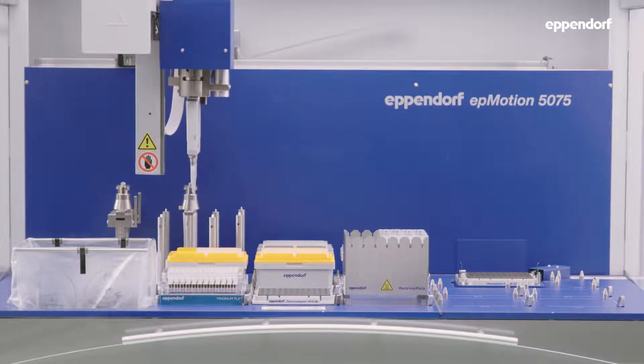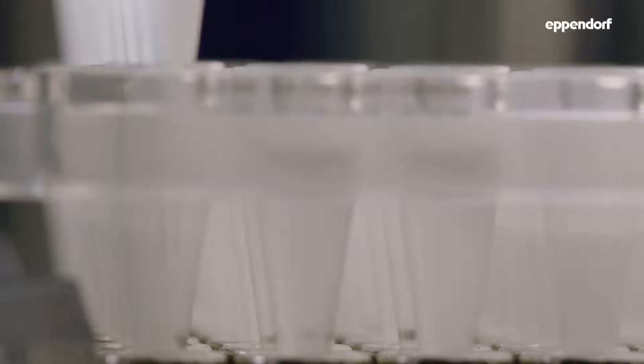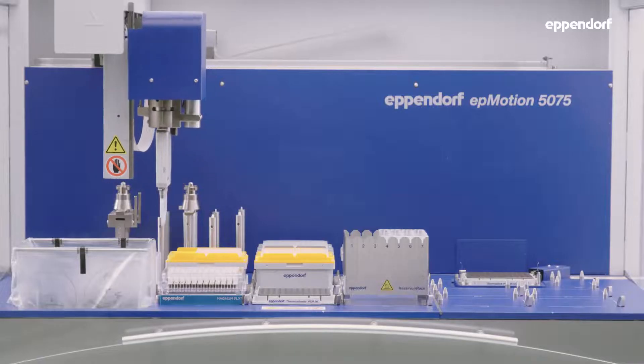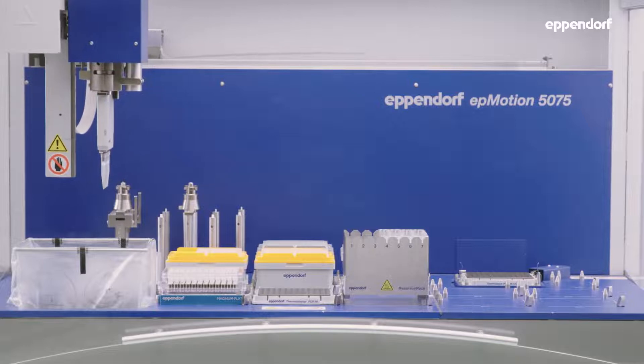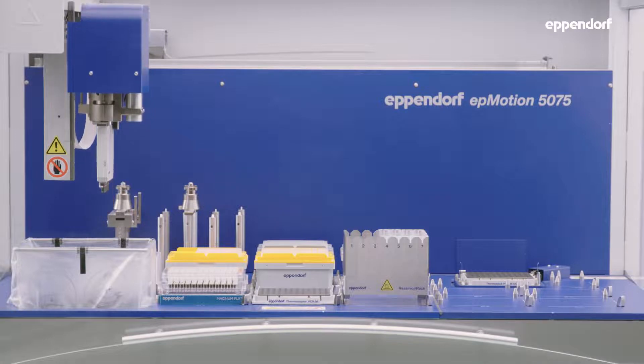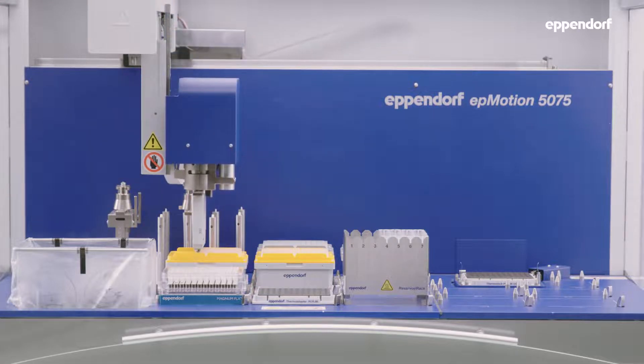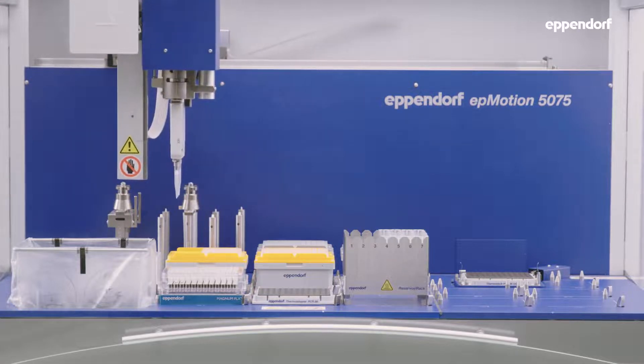In this step, good tip positioning is required to remove supernatant as carefully as possible from the beads. High quality NGS libraries can be generated with accurate supernatant removal for a purified DNA sample. New tips are used for each sample to avoid contamination.